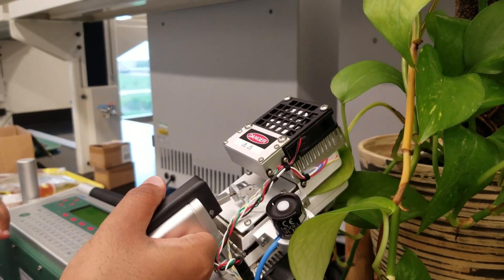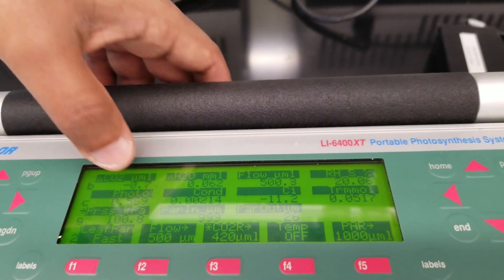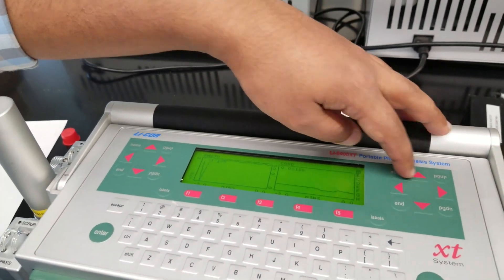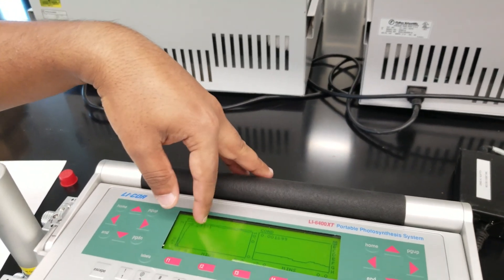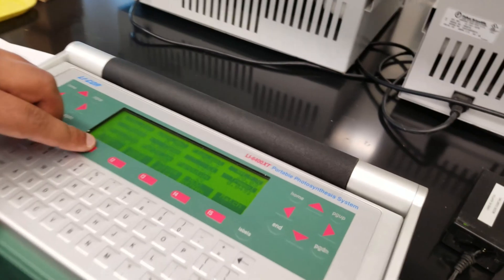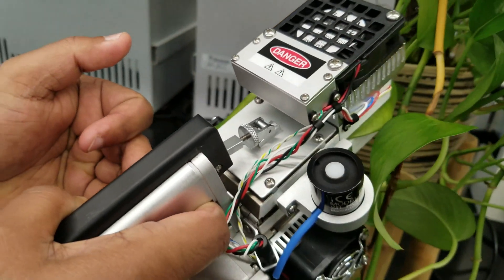In this second video I am showing leaf photosynthesis measurement. I have already clamped the leaf into the leaf chamber and am viewing the data on the screen. The values are going up and the graph is becoming more stable. Once stable, I am going to log the data. Pressing F1 will record the data — right now the photosynthesis value is 1.44. You can also record from the leaf chamber button directly.